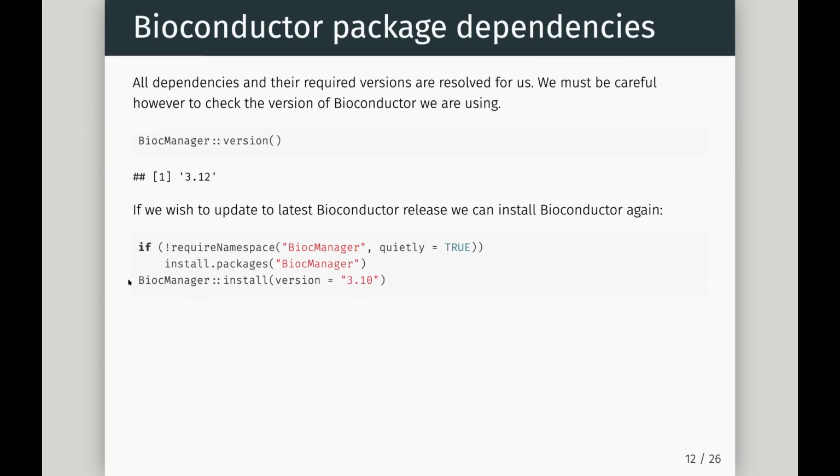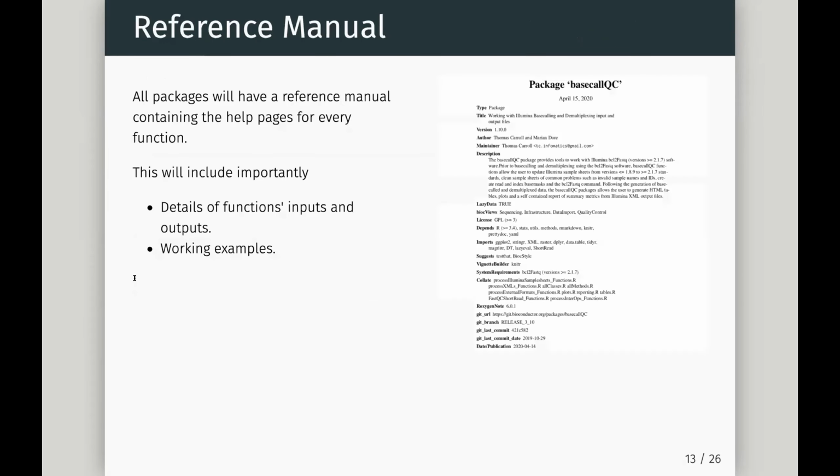If you ever need to change your version, and I strongly recommend you don't do this, you can do BiocManager::install, and then you set your version. I say strongly, don't do this if you're unsure. You want to maintain your versions for the entirety of your project, really.